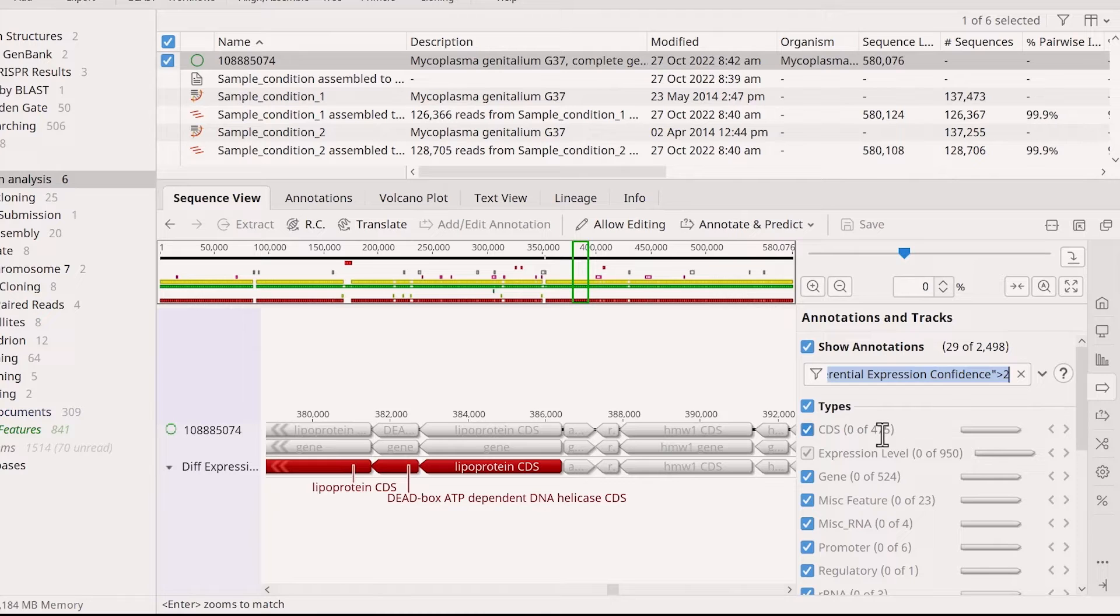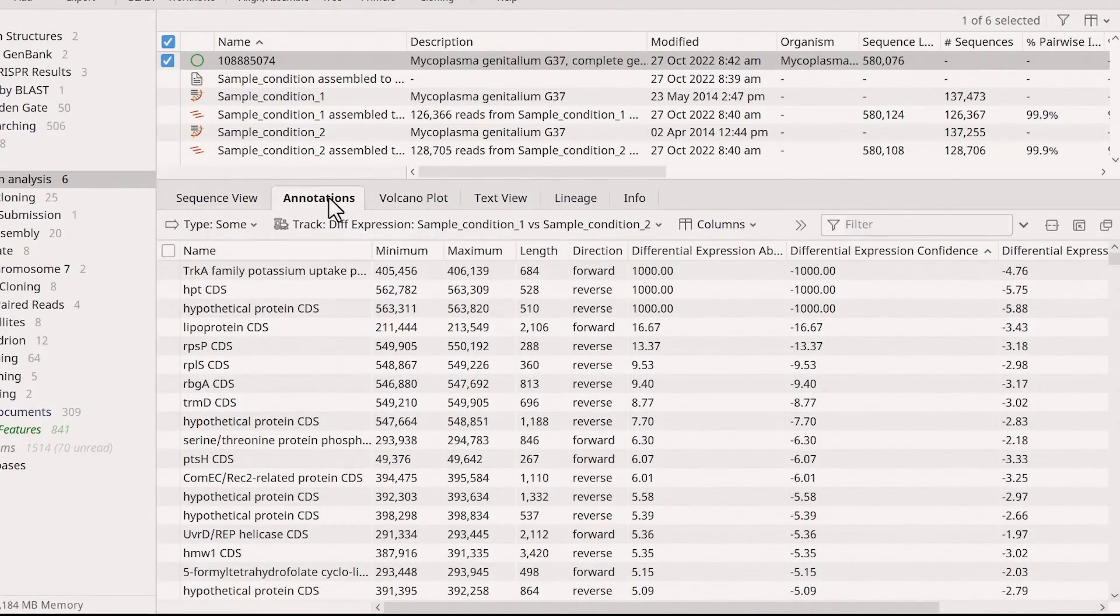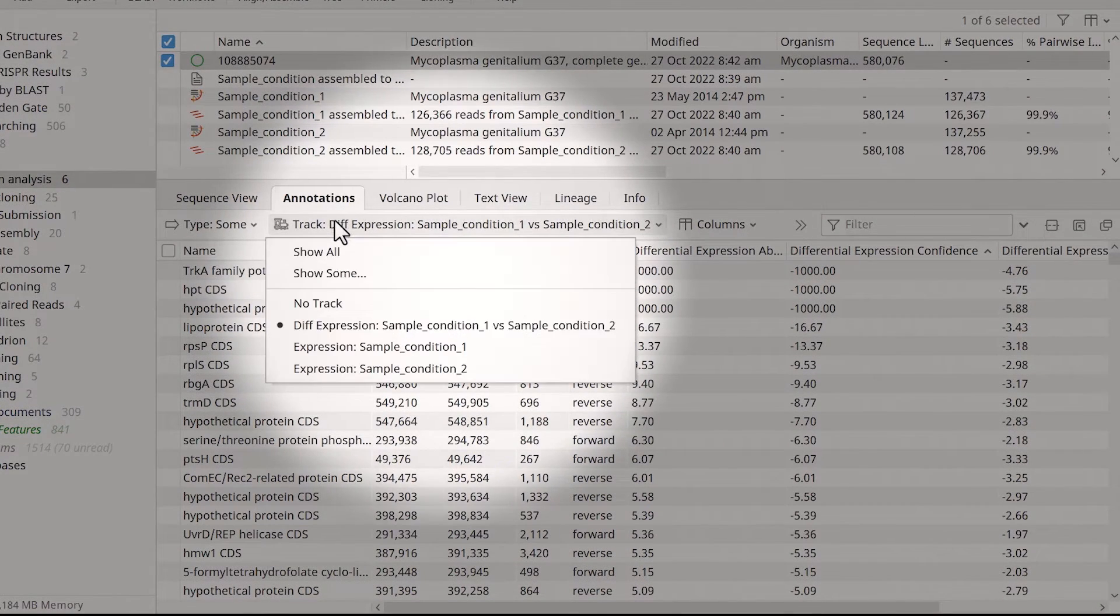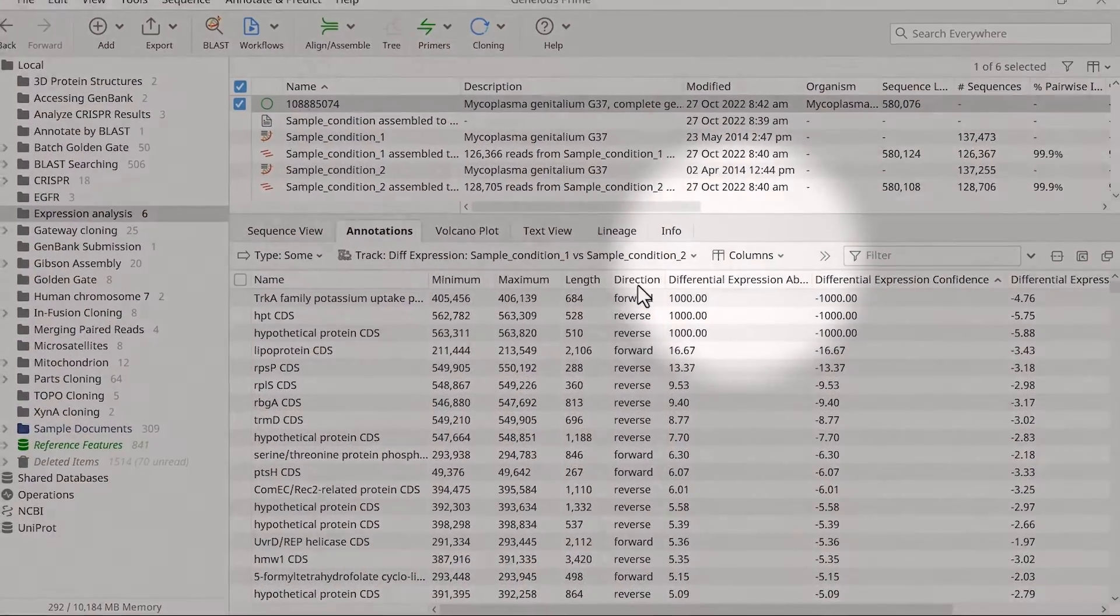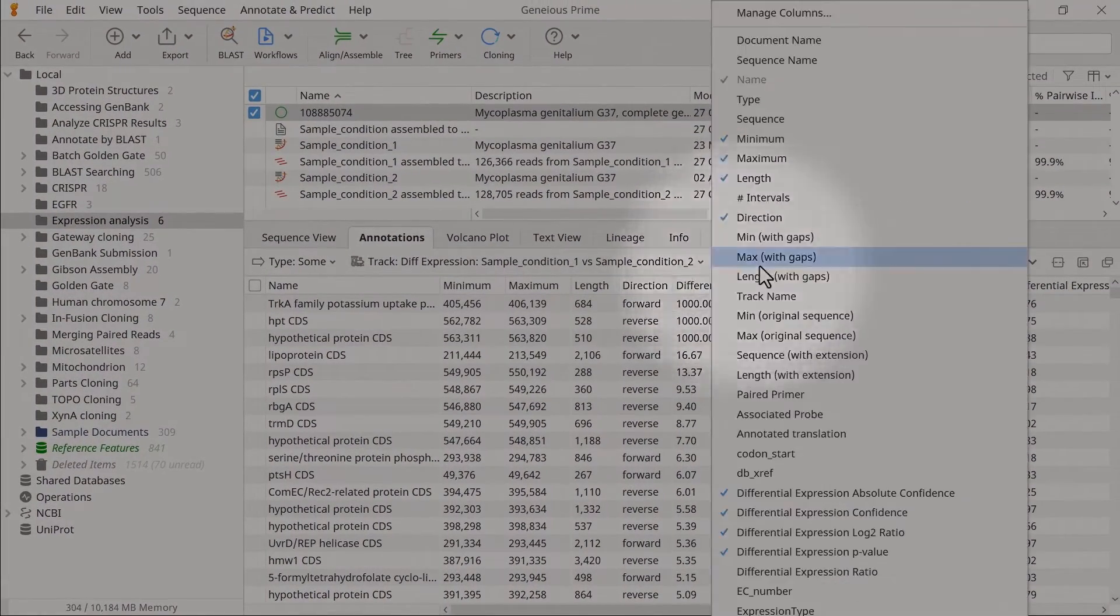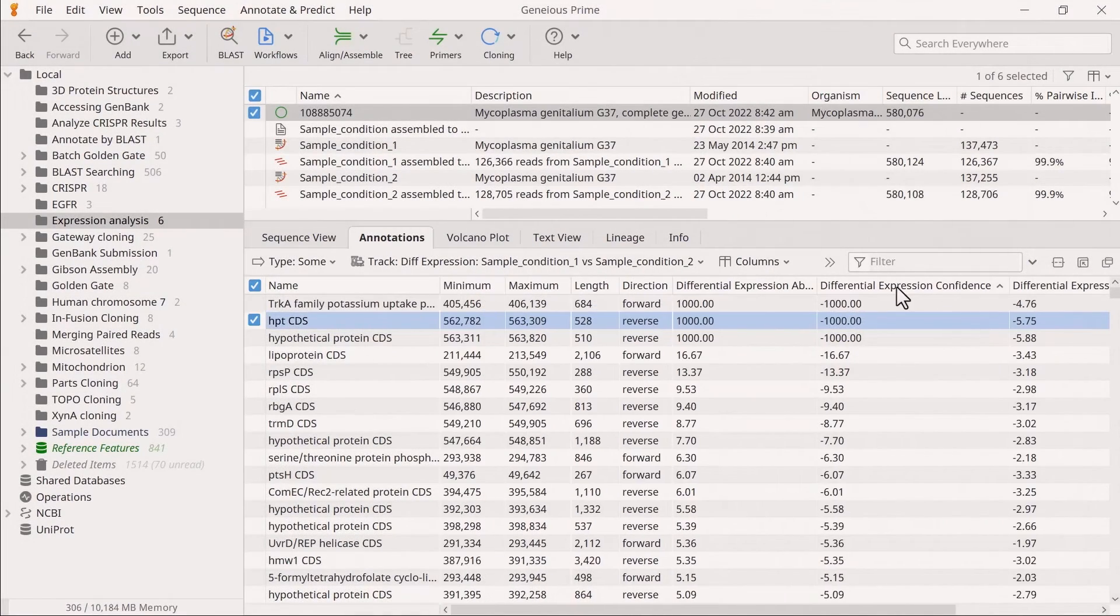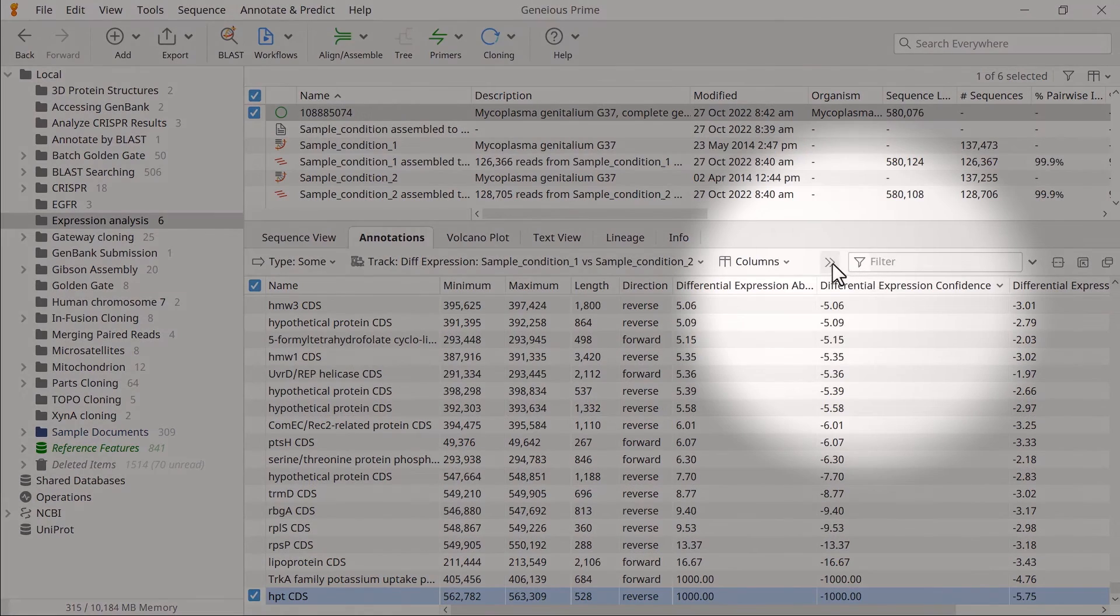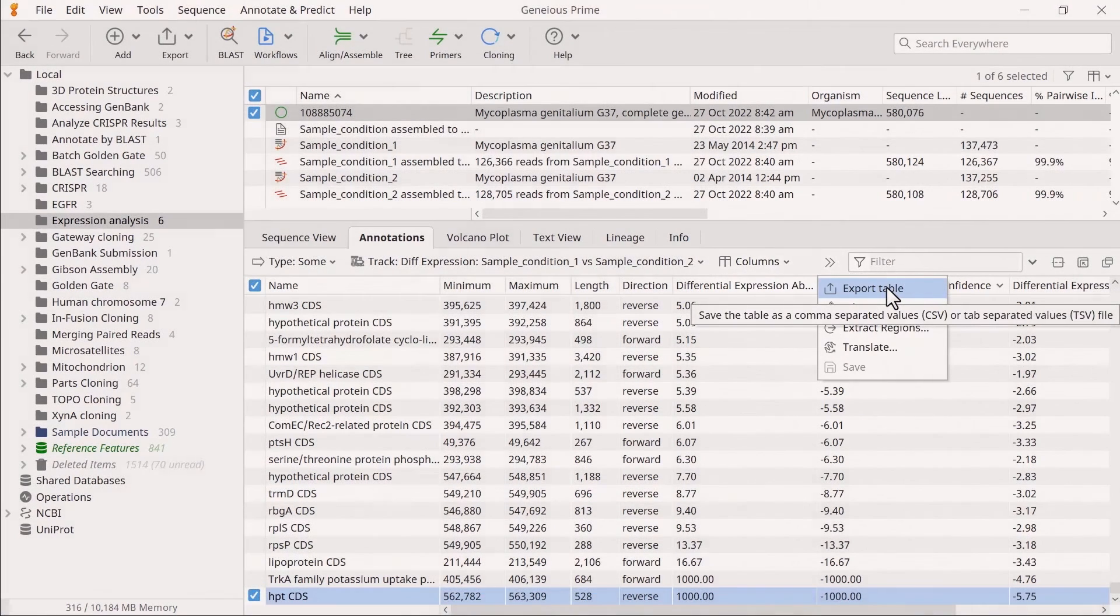Switch to the annotations tab to view the differential expression results in tabular format and view the differential expression track data only. Use the columns drop-down menu to select data of interest, including the differential expression confidence. You can also export the results in CSV format by selecting Export Table.